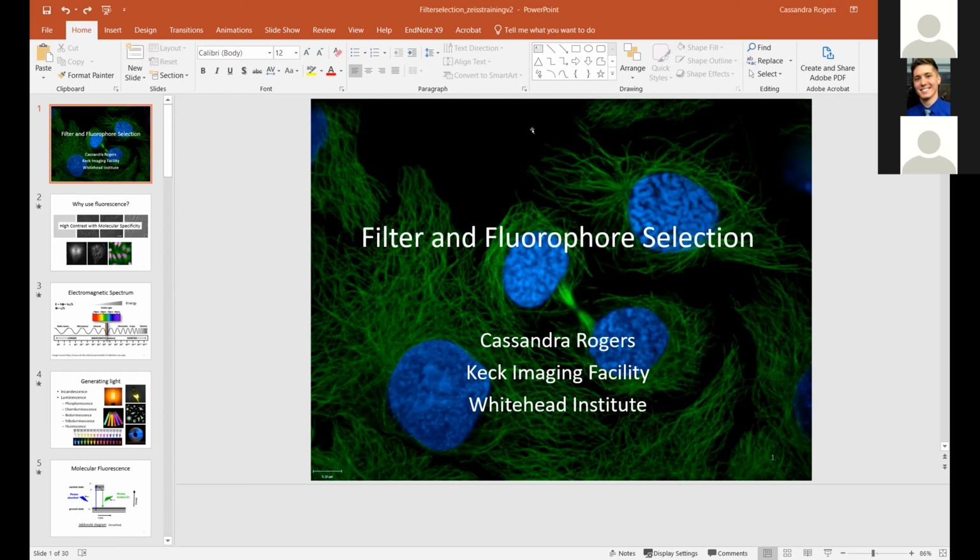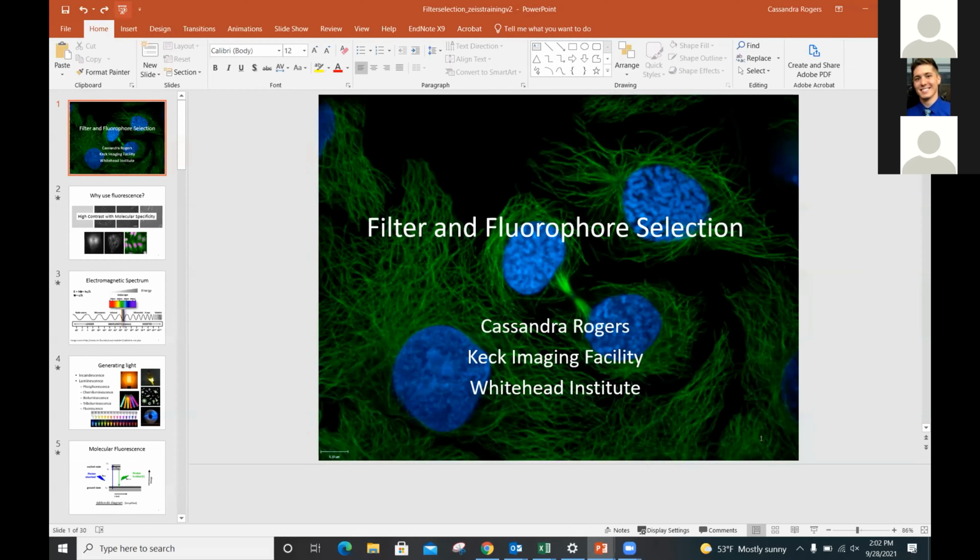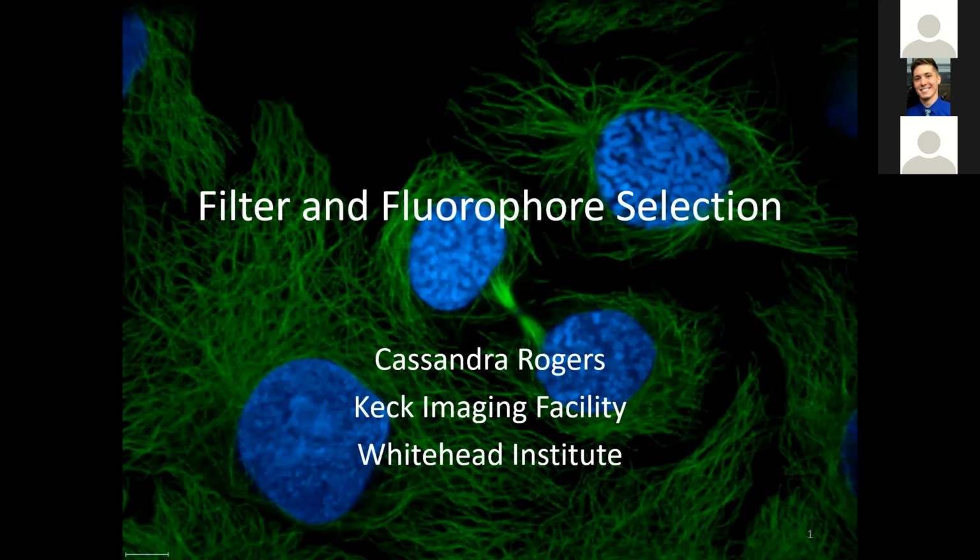Okay, so we can go ahead and get started. This is being recorded, so if anybody misses anything, they'll have something to refer back to. So we just want to talk a little bit about filter and fluorophore selection before we get into selecting filters in the Airy Scan or in the 980.